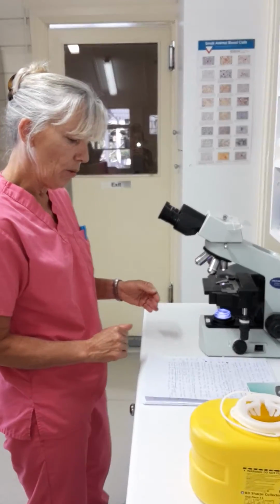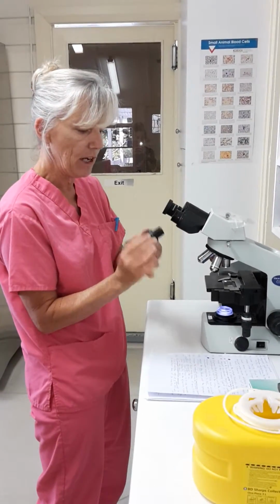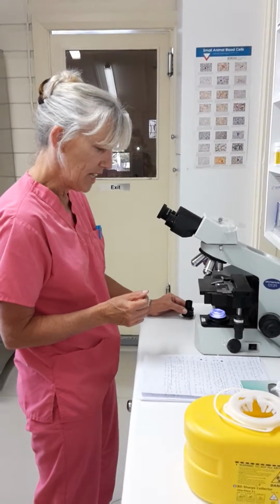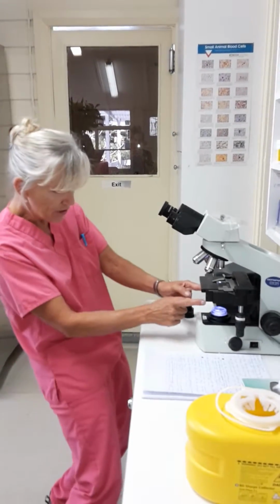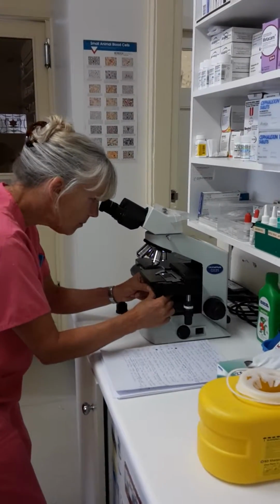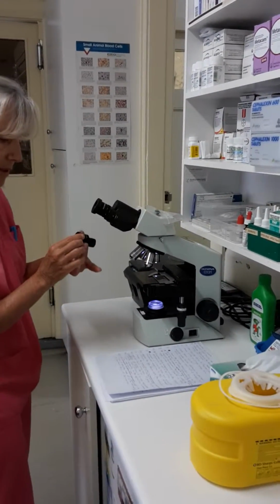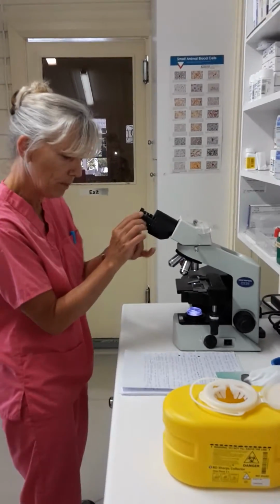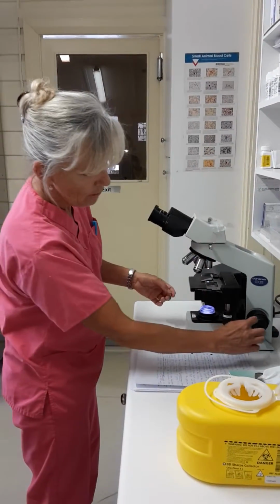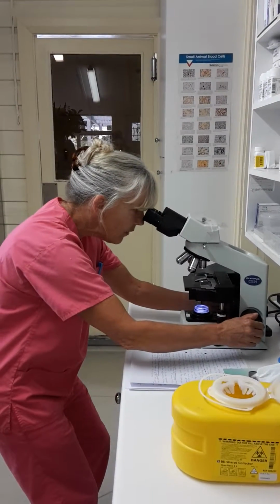So the next thing we're going to do is remove one of the ocular tubes, which is what these things are here, very carefully because it's an expensive piece of equipment. We're then going to adjust the condenser diaphragm, which is this part here. We're going to adjust that to 80%, swiveling it around, and then we're going to replace our ocular back into its spot. We're then going to adjust the fine focus until the specimen is in view. So the fine focus is this smaller one again. So we're adjusting that nicely.